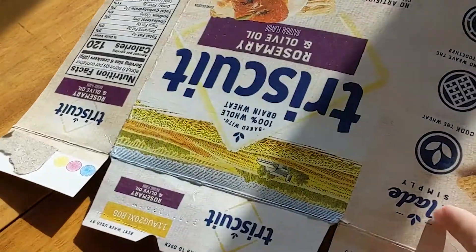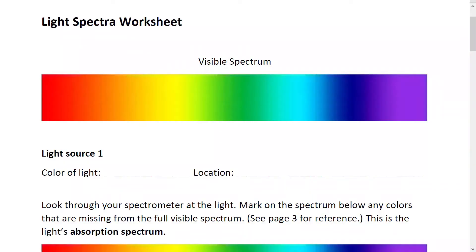You'll also need thin cardboard — I'm reusing this empty box of crackers — and an empty paper towel roll. I don't have one right now, but I do have a toilet paper roll, which means I'm actually excited to have run out of toilet paper. However, a longer tube definitely gets you better results. Lastly, for taking data, you'll want our light spectra activity worksheet. If you don't have access to a printer, you can make your own by writing down the questions and drawing in a rainbow band for reference.